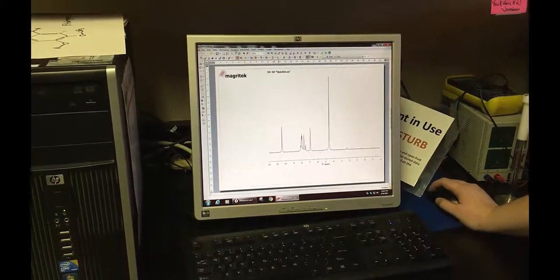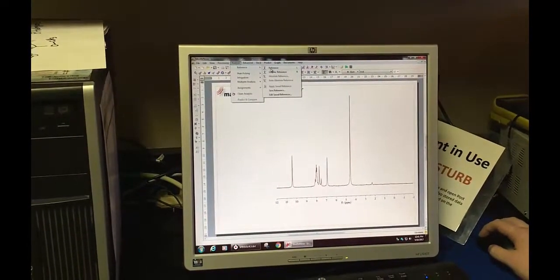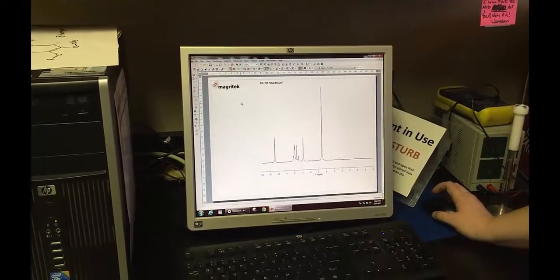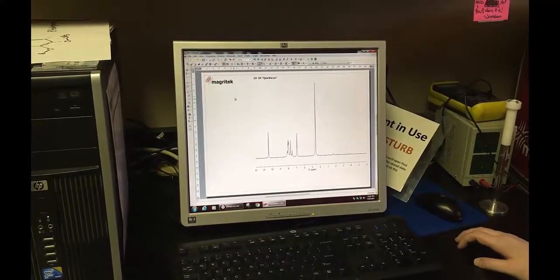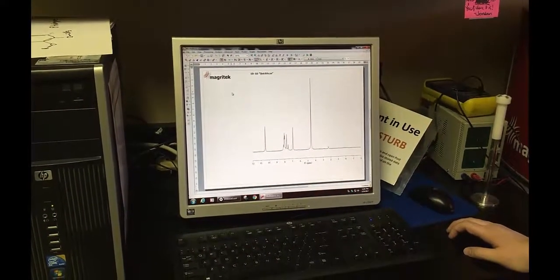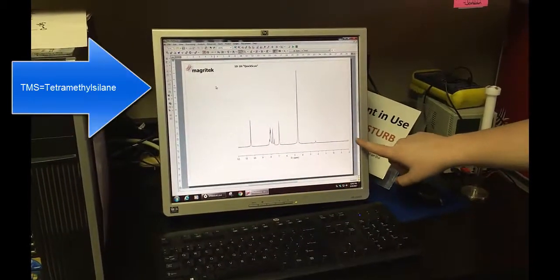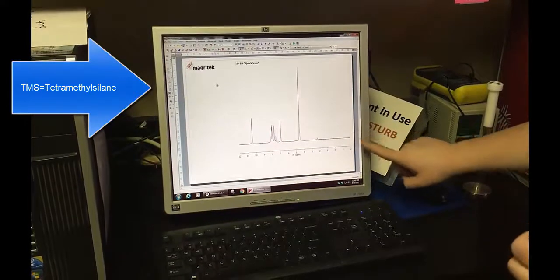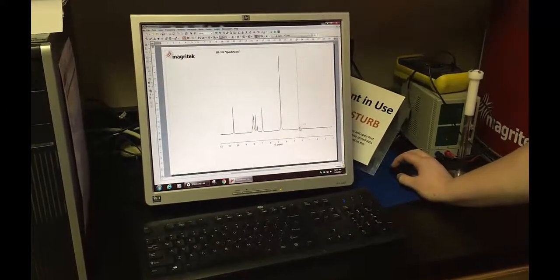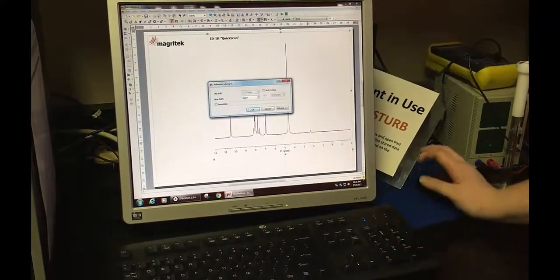So you go back to Analysis and go to Reference, Reference L, and you're going to decide which peak is your solvent peak. Now different things will have different solvent peaks. Today I used deuterated chloroform, which means it has TMS in it. TMS is going to come out at the furthest peak to the right. And so this little peak right here is going to be my TMS peak. So I click on that, and that's going to be set at 0.